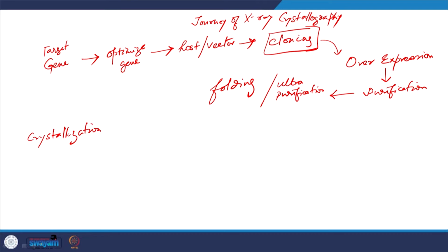As discussed, crystallization is the check line. If you do everything perfectly, still you may have a problem, it is the crystallization, and we have spent a lot of time looking at how to crystallize, what are the factors affecting crystallization. We also admitted that it is not even considered a science, it is considered an art, like we do the process, it is rather the maintaining of the process and depending on luck. But we did whatever we could.